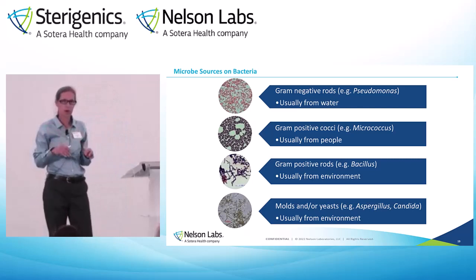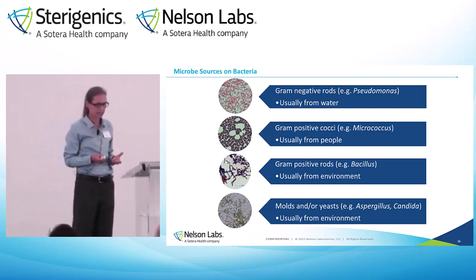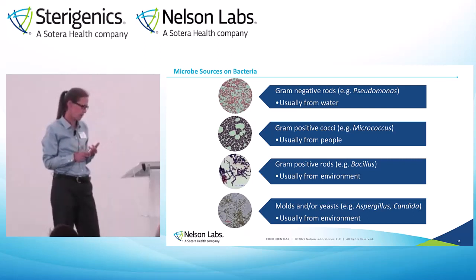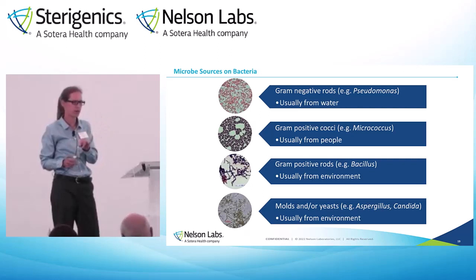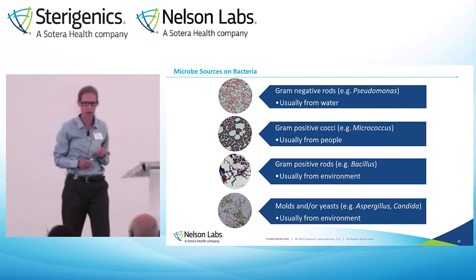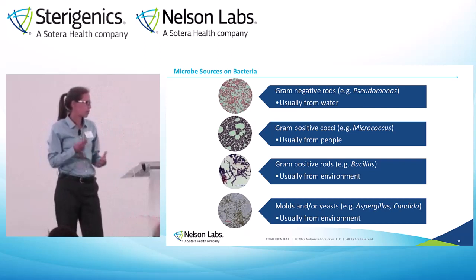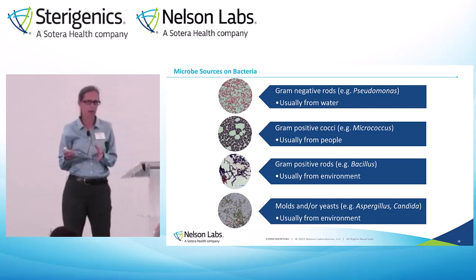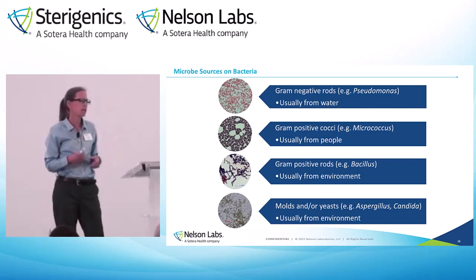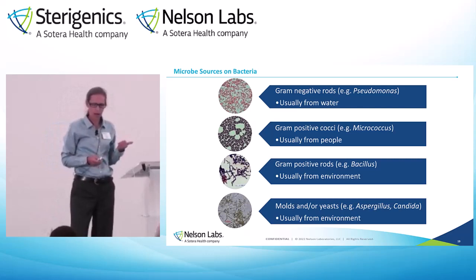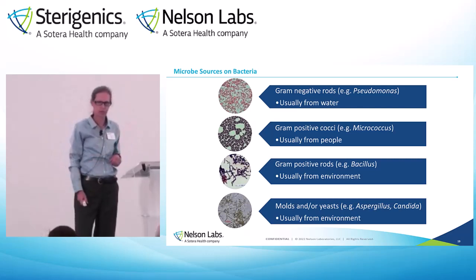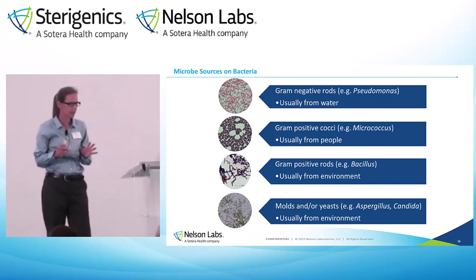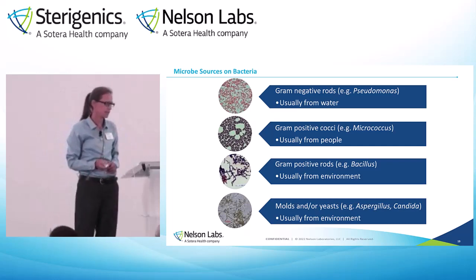Knowing what organisms are on your product can be very helpful. If you have gram negatives — which aren't super common — they tend to be the ones that make people more sick. If you've got them, it's usually pseudomonas, because that lives really well in water. If you've got a pseudomonas or gram-negative problem, maybe you need to check out your water. Gram positive cocci tend to come from people — we have different types on our skin. If you have gram positive rods, or molds and yeast, they're generally coming from your environment.